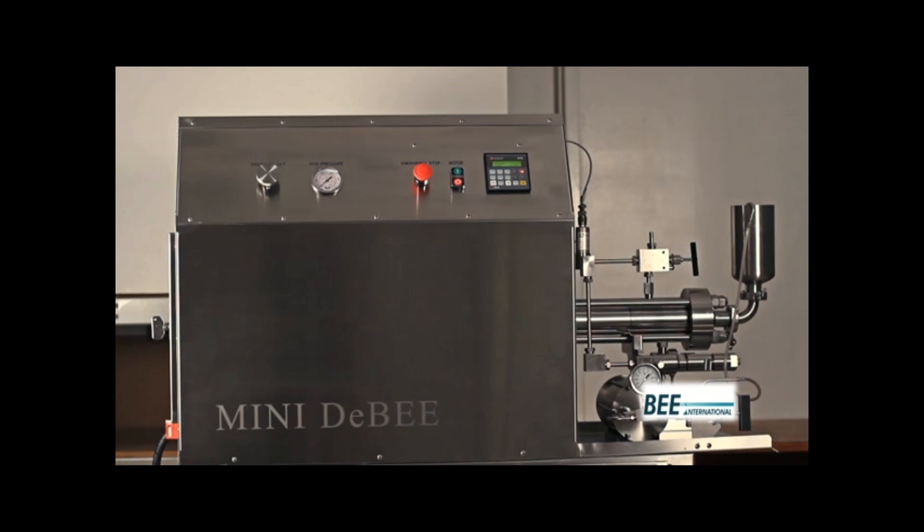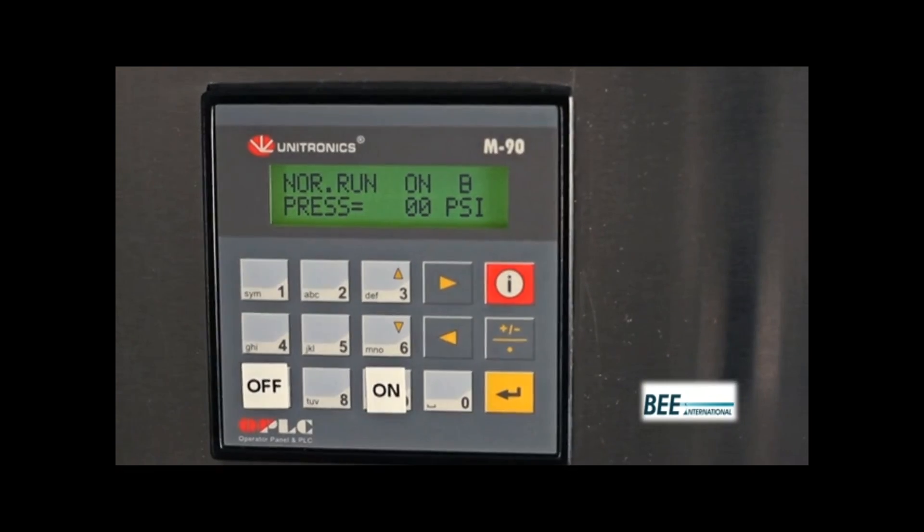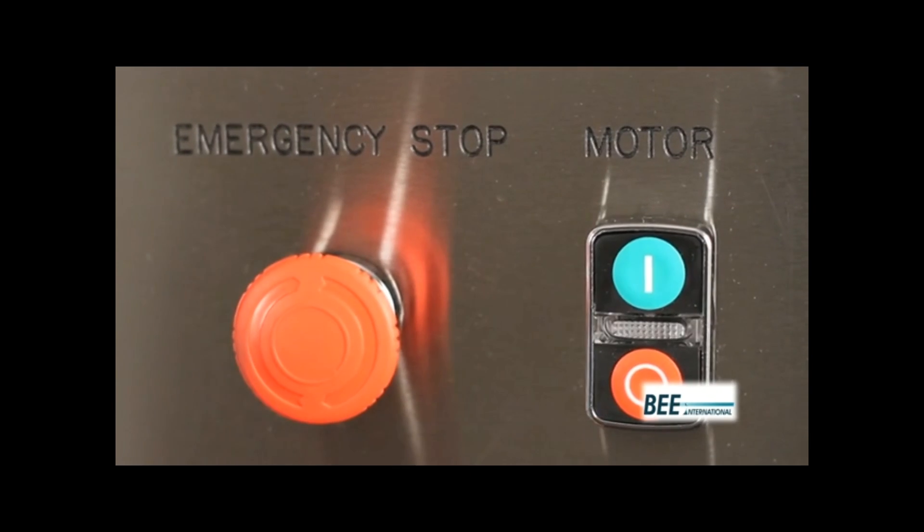At the end of operation, turn the pressure set dial counter-clockwise until process pressure reads zero and press off on the PLC to turn off the intensifier pump. Turn off the motor button.